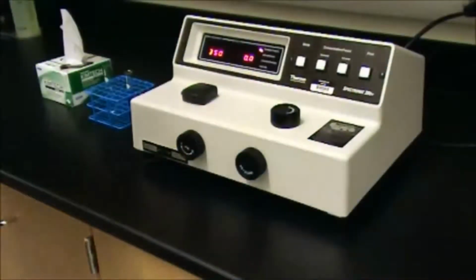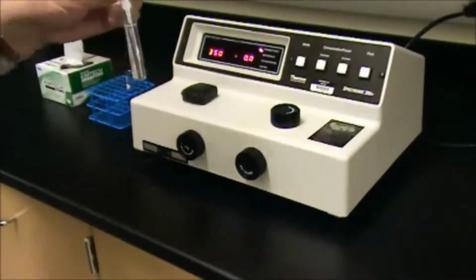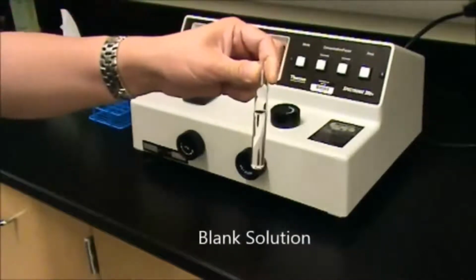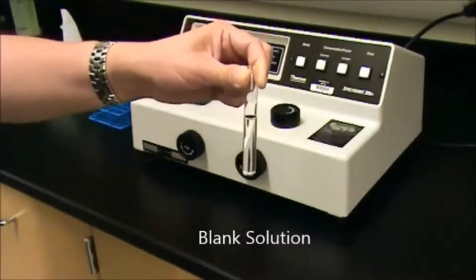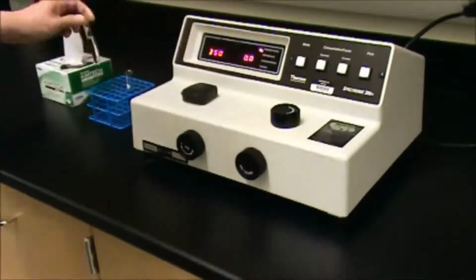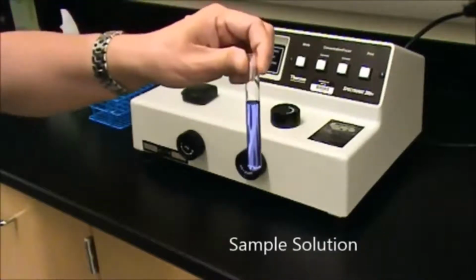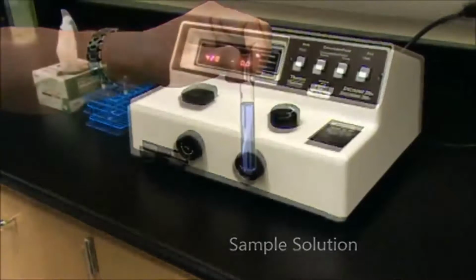To begin using the spectrophotometer, you have to have your samples ready. So first, you should prepare a blank solution. And the blank solution has everything in it except for the molecule or compound you wish to measure. Then you should also have a tube which contains a sample which you want to measure.